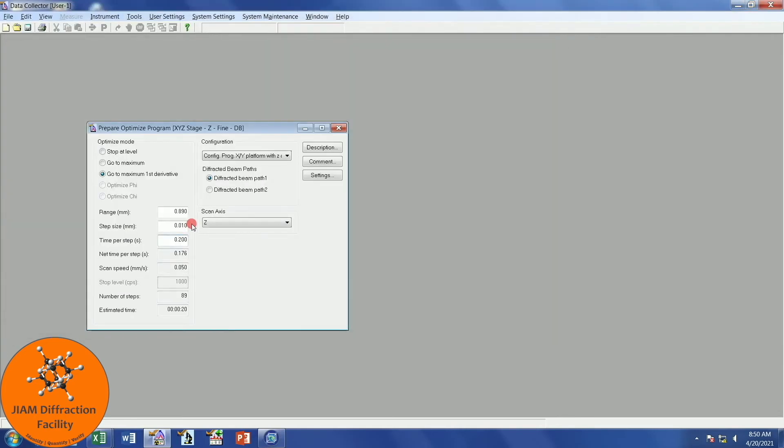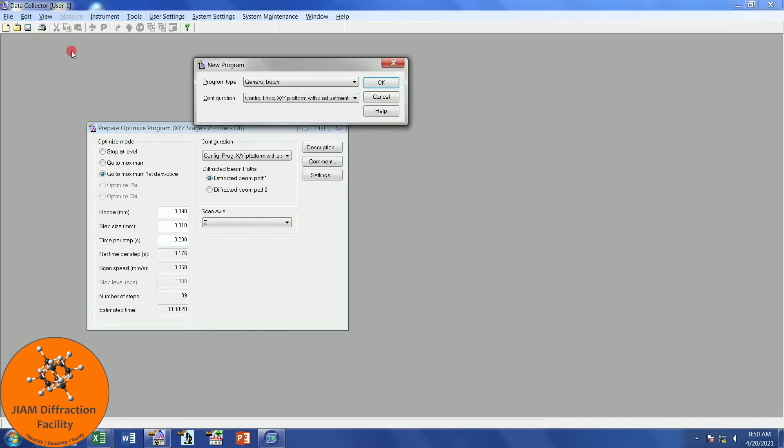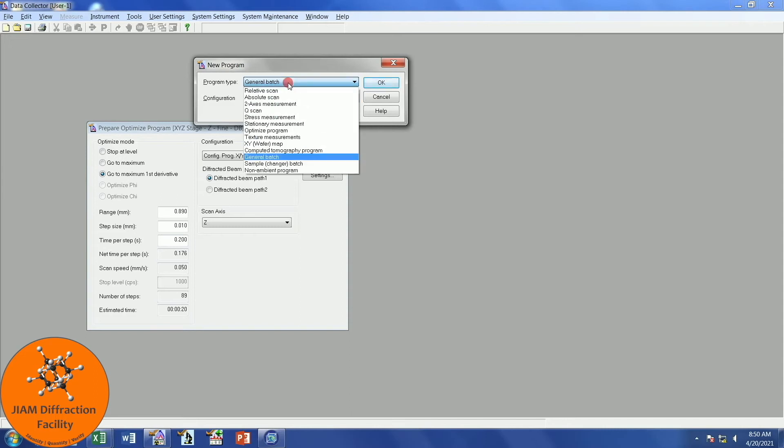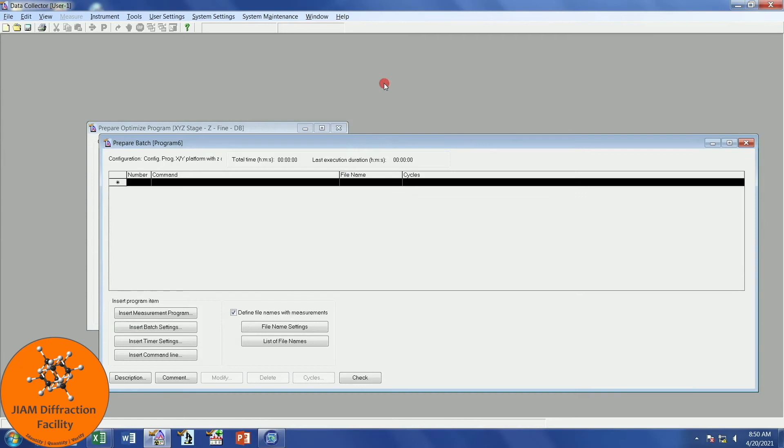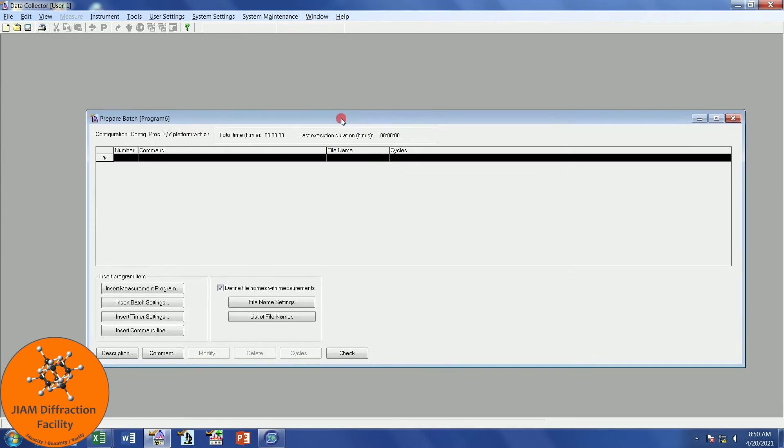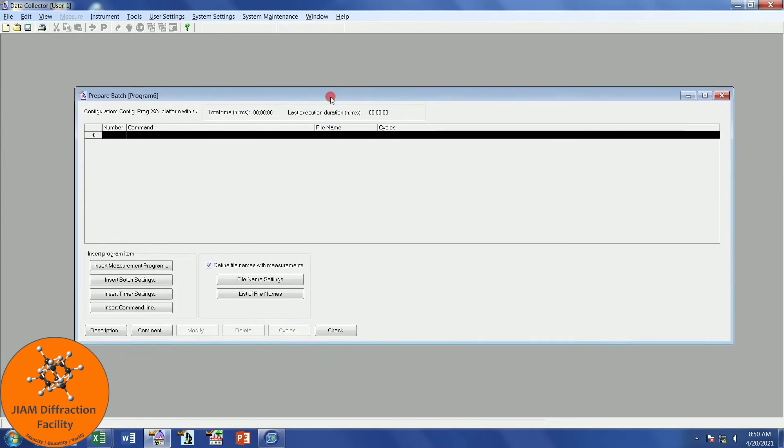Now that we have all of our individual scans saved, we can create a batch program to perform our alignment. Let's create a new program. This is exactly what we want. General Batch. We see our correct configuration here, XYZ Platform. Okay. We have a very different looking type of window.